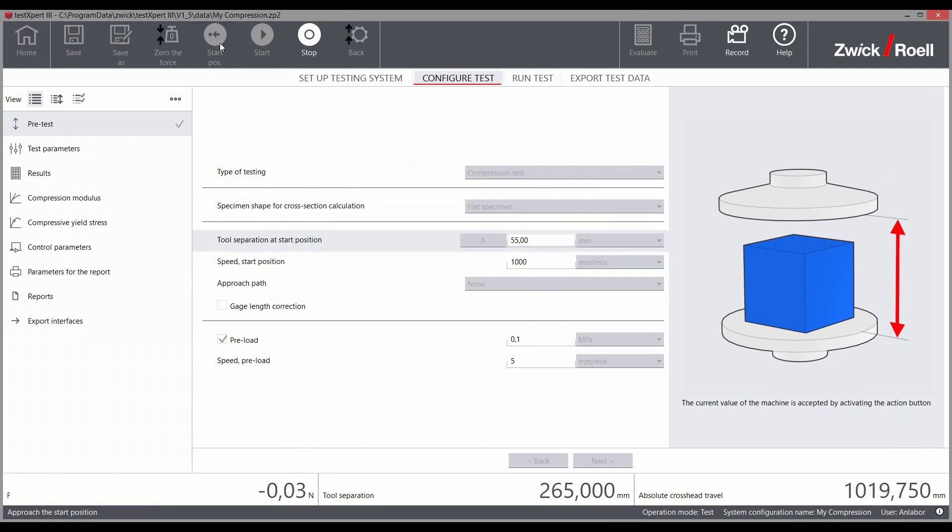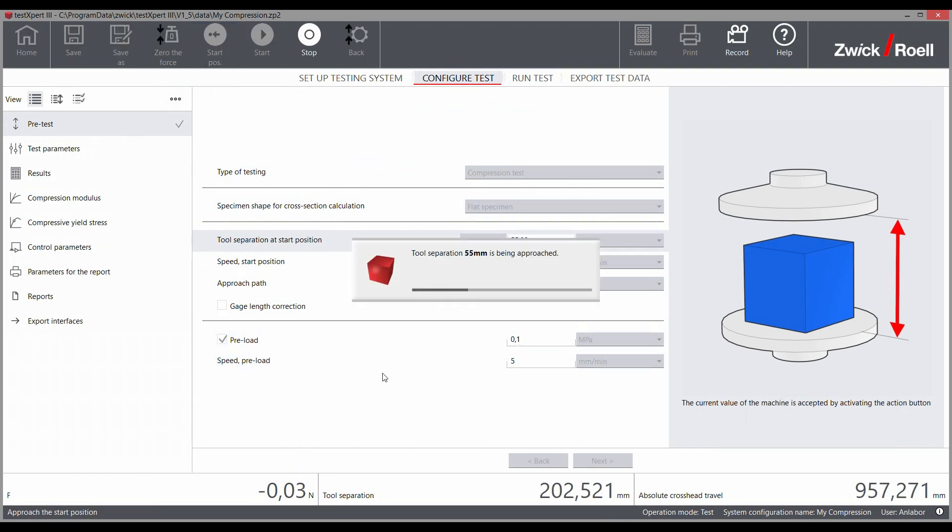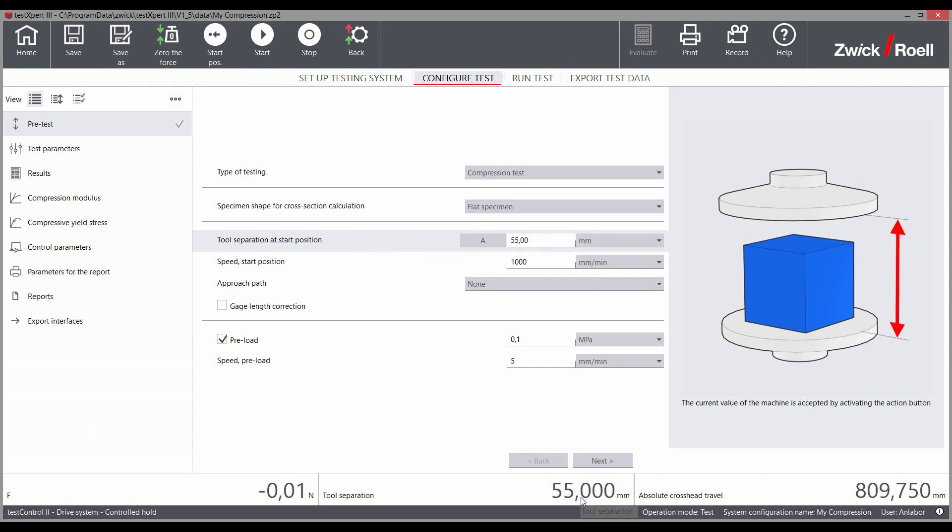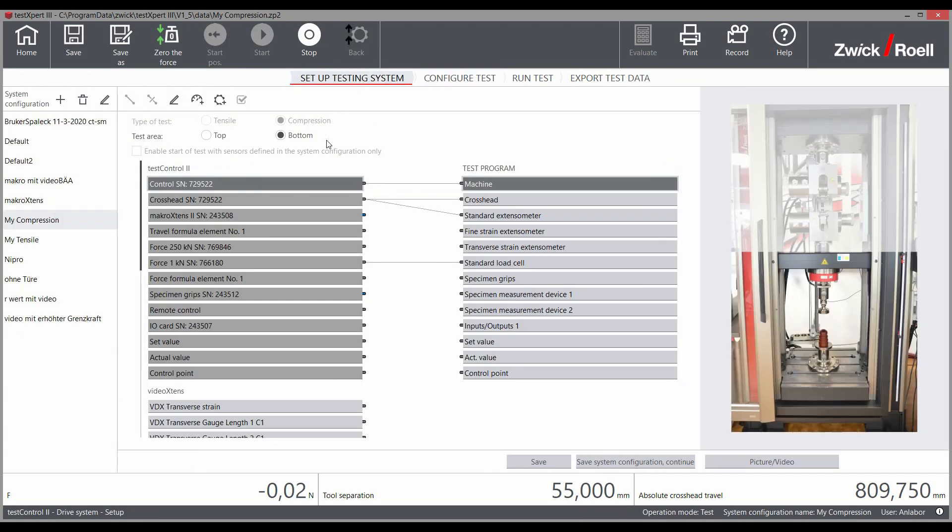Each of the tests for this test program begins at the exact same start position and reproducible test results are guaranteed. Here you can also see your test arrangement and the associated sensor technology at a glance.